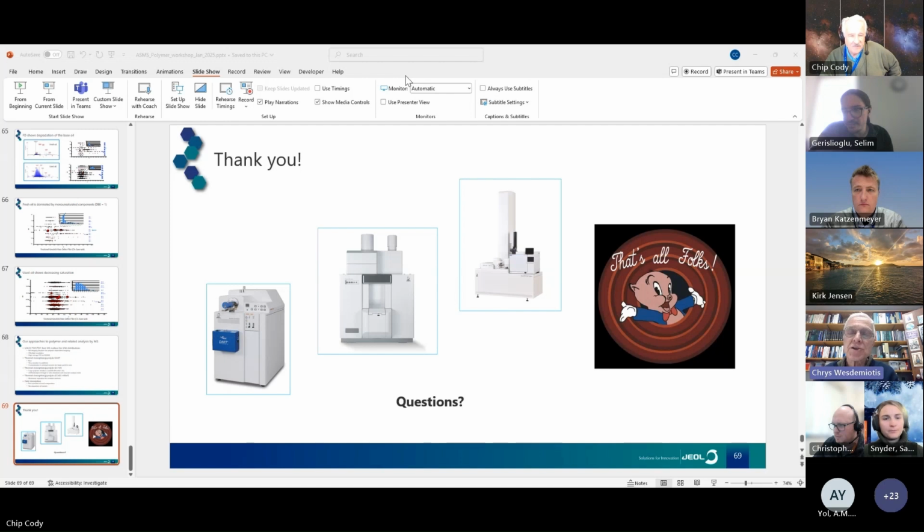So the degree of oxidation that you see is a nice way to classify aging, it seems. I mean, the more aged something is, the more oxidized you'll find it. Yeah, that's nice. To me, it seems something similar to, I mean, Savannah is here in the audience, but part of her dissertation was to analyze particular sediment in motor vehicle engines. And actually there also, I think she observed oxidized polyethylene. I remember, didn't you see? Oh, that's interesting. Yes, oxidized, and that leads then obviously to aggregation, because it becomes polar now and can form those particles. So I thought, I should give you credit for that.